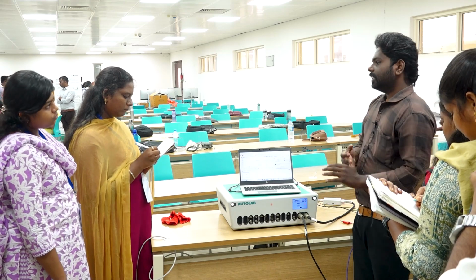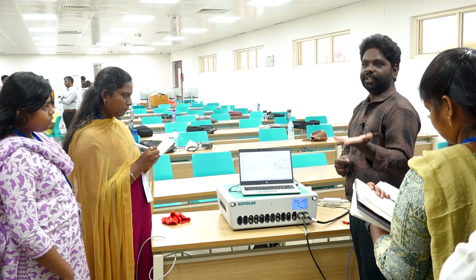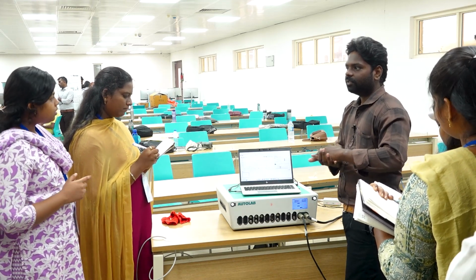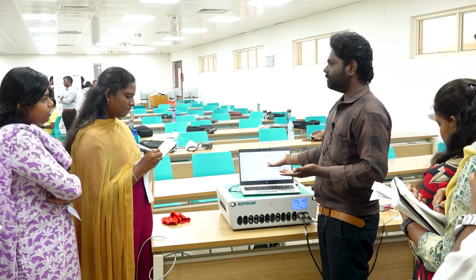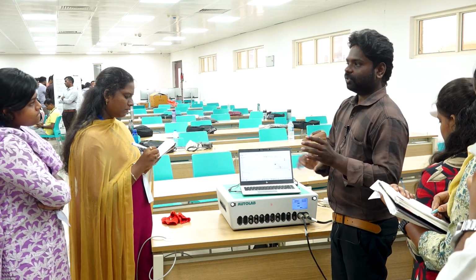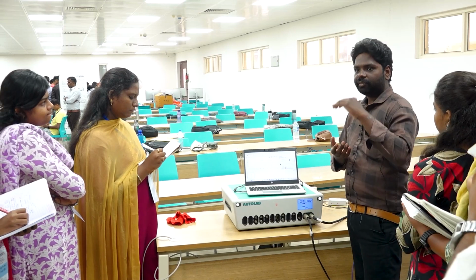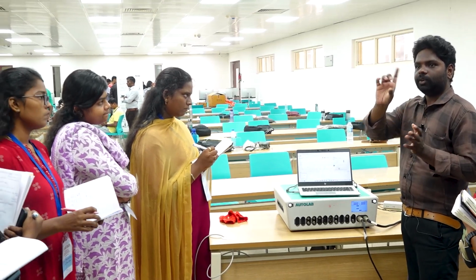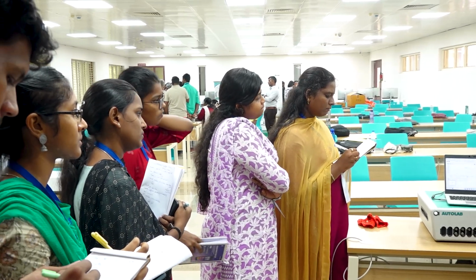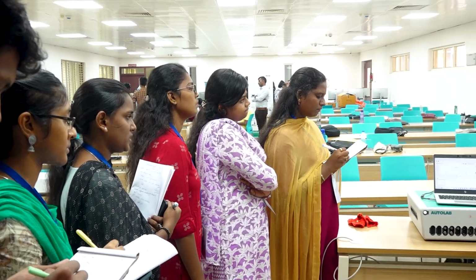So if you have more capacitance, what will happen? Any idea? If it is less, it will be suppressed. If it is more, what happens? Full? It is also a full semicircle. It's a complete semicircle. If you have a good double layer capacitance, your graph will come like a complete semicircle. If the capacitance is less, you will get a suppressed semicircle.